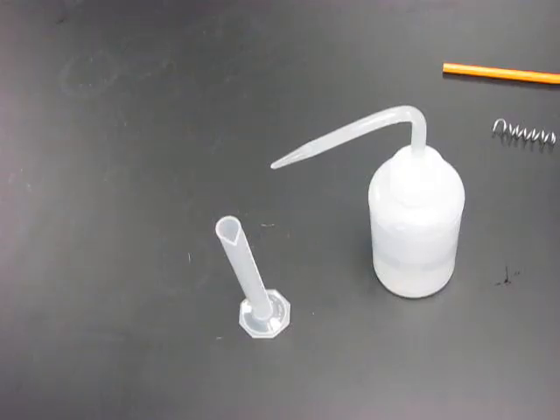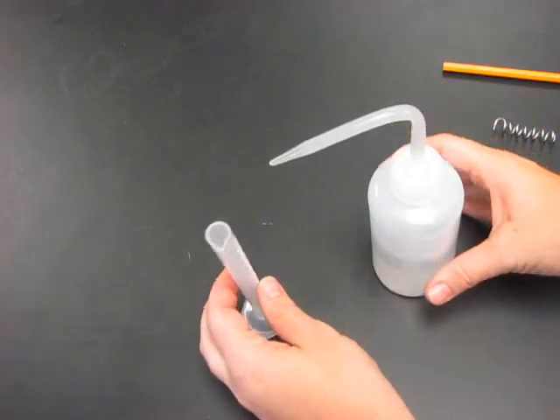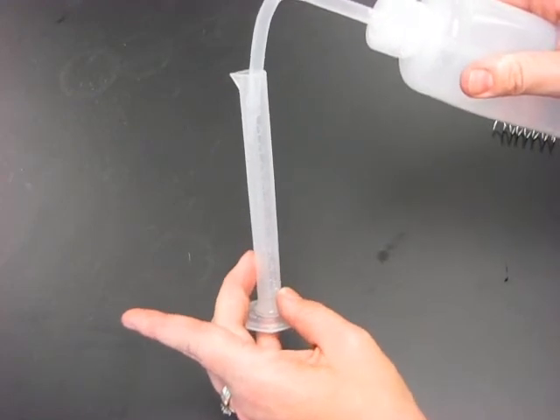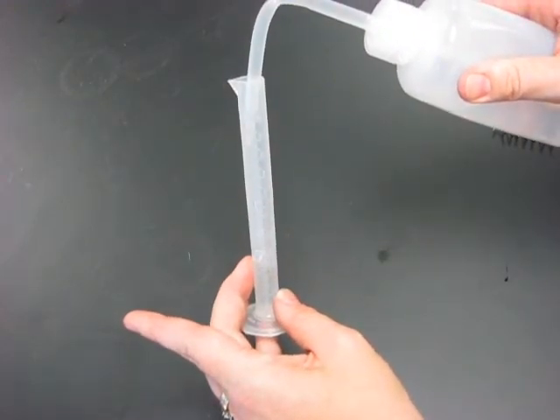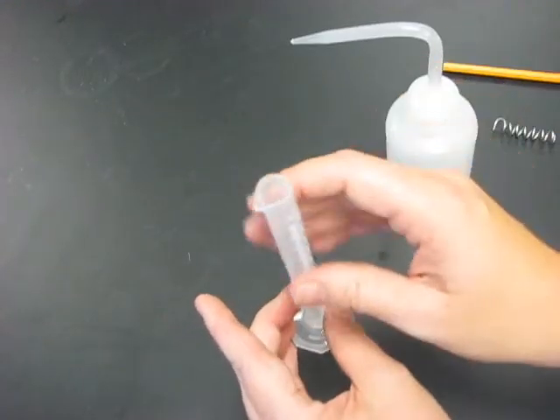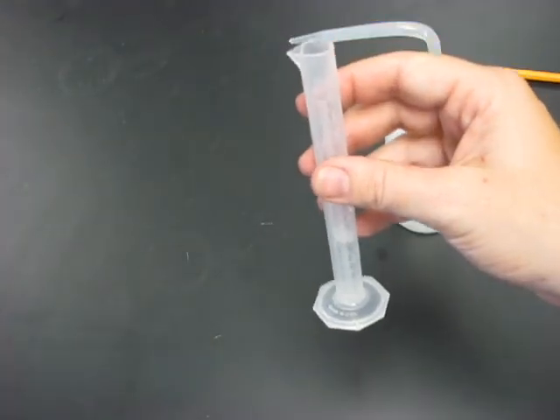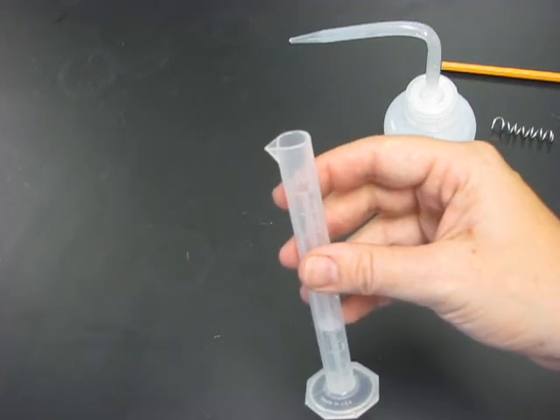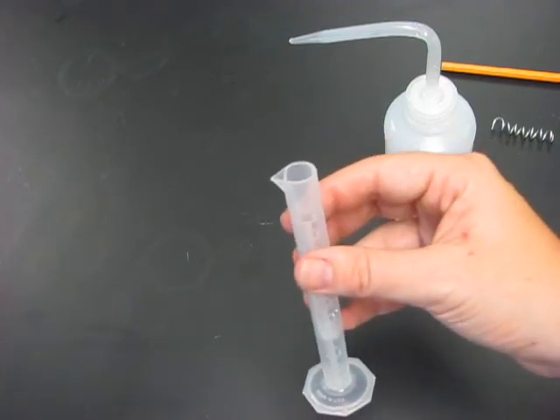Step 12A refers to washing your precipitate. Next to step 12A, make yourself a note that washing means we are going to add 3 milliliters of water. So you'll take your distilled water from your wash bottle, you will put 3 milliliters of water into your graduated cylinder, and then you will pour that through. You're going to do that a couple of times, and then the next step tells you to do the same but with 5 milliliters of ethanol.